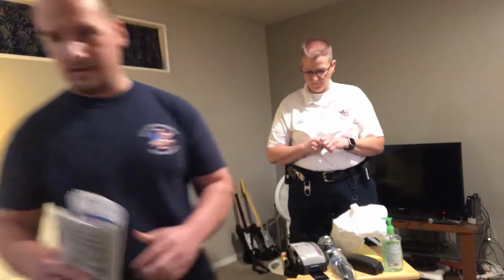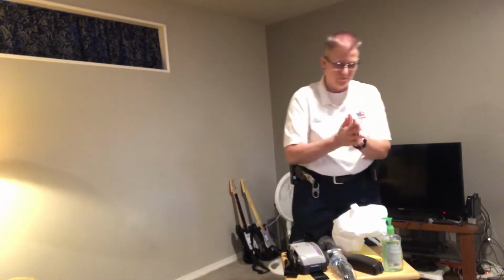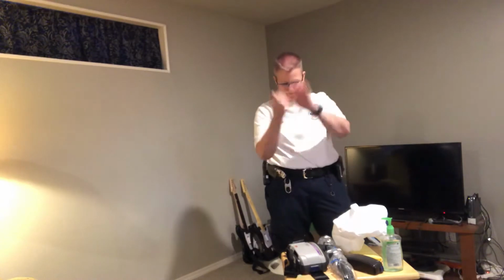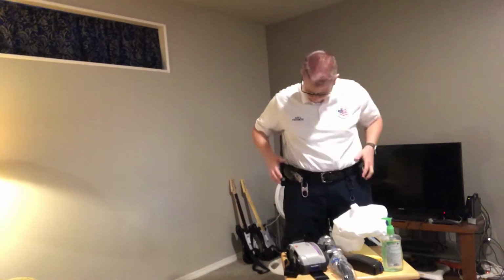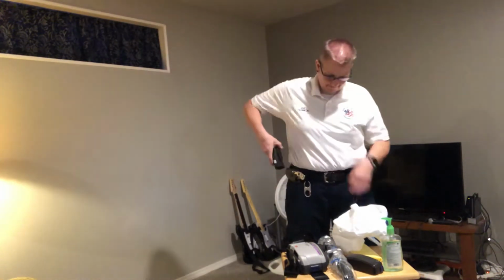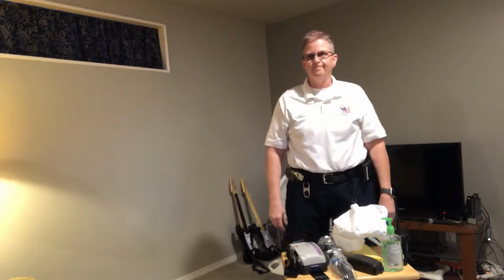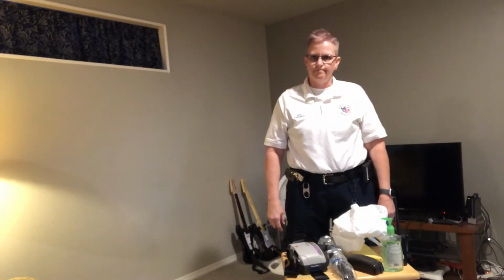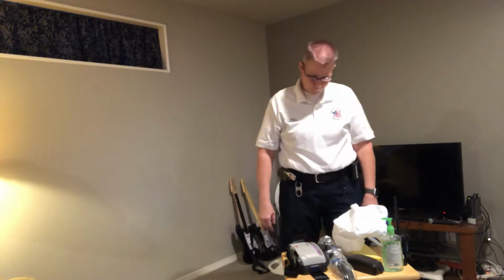Anyway, step back out. Okay, so first of all, you're going to want to remove all of your personal items, such as jewelry, keys, phones. Basically, the less, the better. I know in EMS that's slightly impractical because we do carry a lot of junk on our belts, including radios and phones and Raptors and whatnot. Try to strip down whatever you can. We don't need the full bat belt on when you're using this.